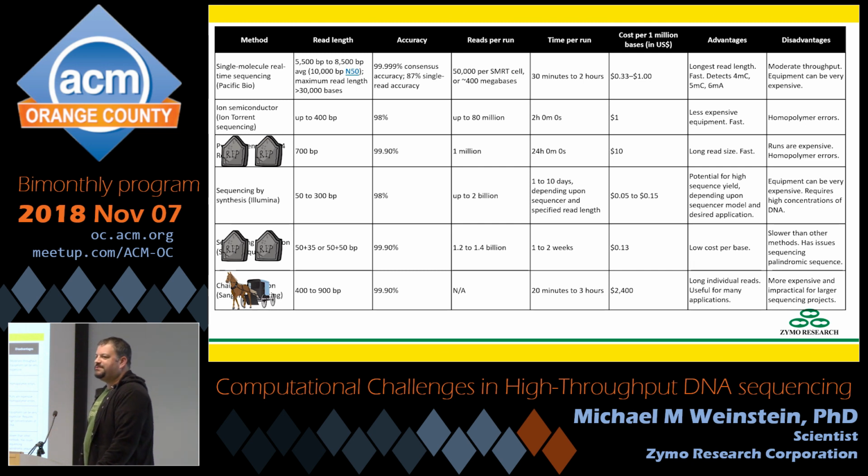The essence of Illumina sequencing is sticking a piece of dye on the end of a growing strand of DNA, flashing some light at it and seeing what color it lights up, and then changing that color every time you put on a new base as you synthesize. So you get a green flash when you add one base, you'll get a blue flash when you add another base, you'll get an orange flash from another base, and so on and so on. And the machine will just read these flashes as it goes.